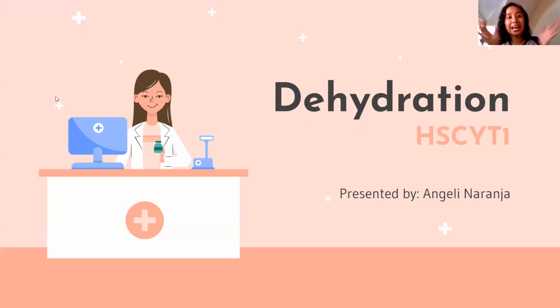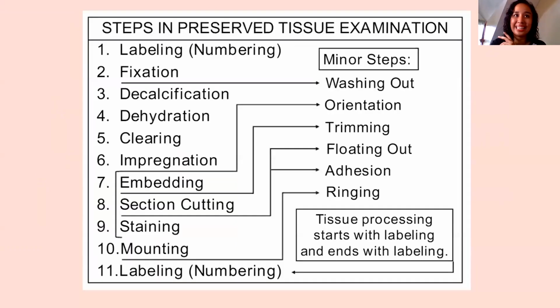Okay, guys, so welcome to our next topic, which is dehydration. Let's begin. So, guys, could I just reiterate our process, our steps with tissue processing? Okay, so andito na tayo sa dehydration. So, after decalcification is dehydration.